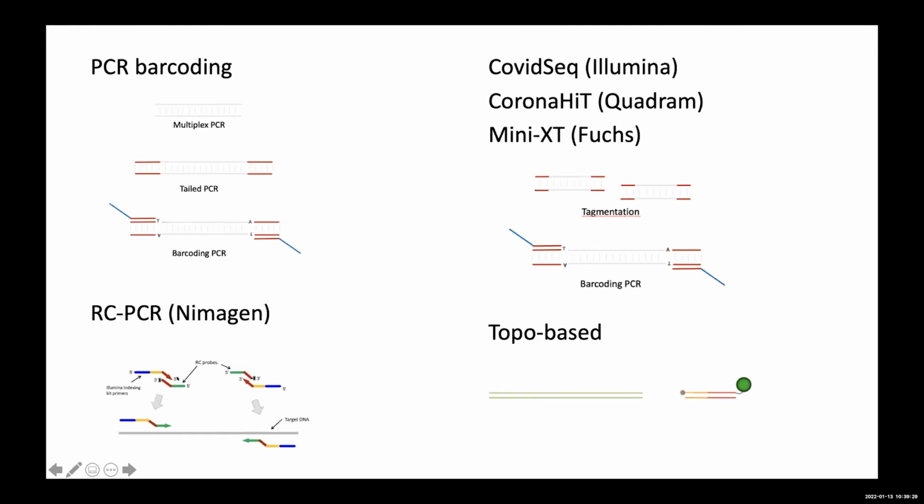Because they have this region of complementarity, you can extend your Illumina primer to contain the gene-specific target sequence from your probe, and this is blocked in the reverse direction, so it just happens in the forward direction to create a multiplexing primer pool inside the reaction. So that's quite an interesting idea, and has been used in this UK wastewater surveillance project, among other things.